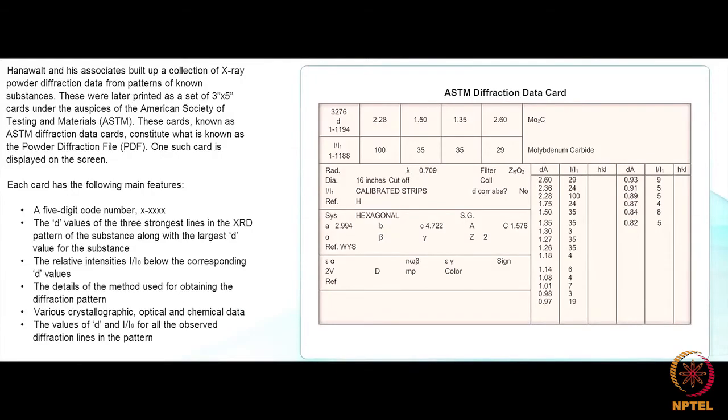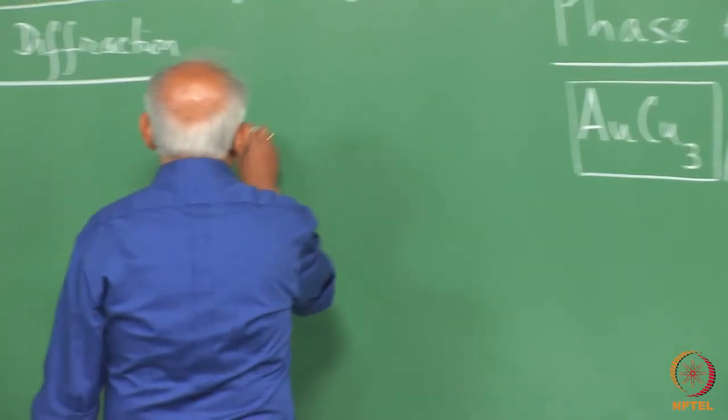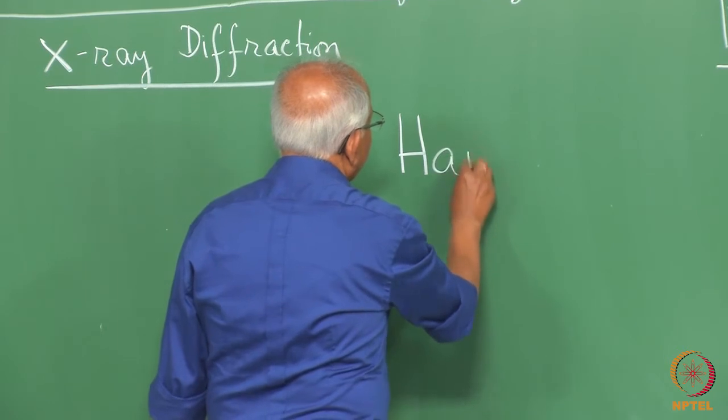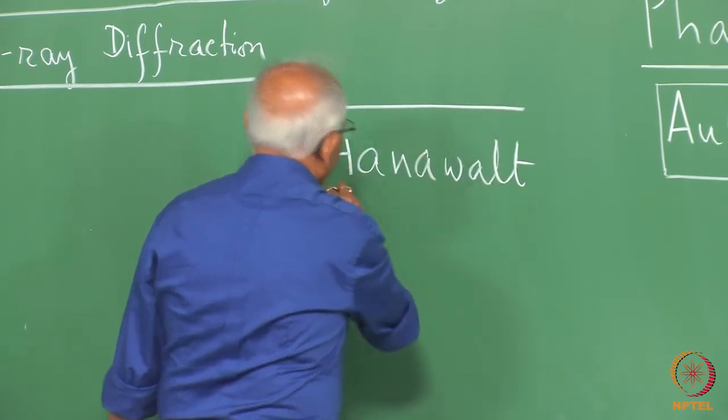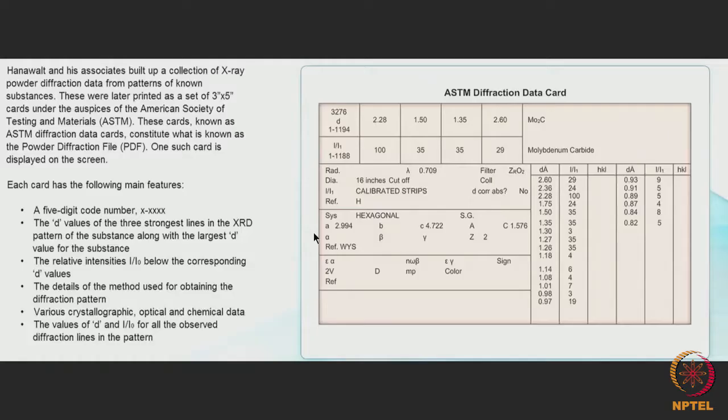Now, this method evolved over a period of years, and it owes a lot to the effort of Hanawalt. So, Hanawalt and his associates, they built up a collection of X-ray powder diffraction data from patterns of known substances.